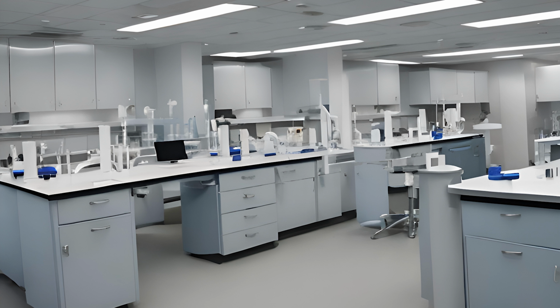Ideally, through designing your processes and your lab tests, you pick your equipment, you design your laboratory in a manner that reduces the need for an awkward posture and reduces the need for repetitive motions in the first place. Failing that, if you can't do those things, then you train your staff on ways that they can mitigate that risk to themselves, and periodically assess the processes that your employees go through to see if there is now a new and better option which can reduce or eliminate the need for repetitive motions in one of those laboratory tests that's being performed.